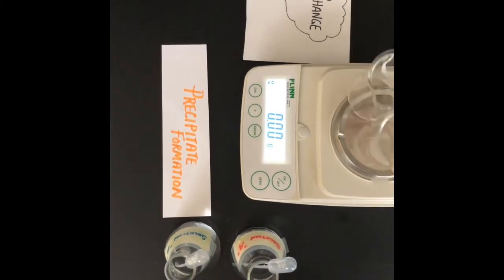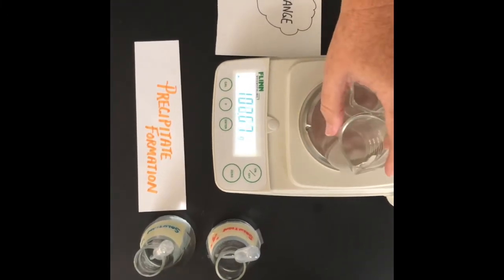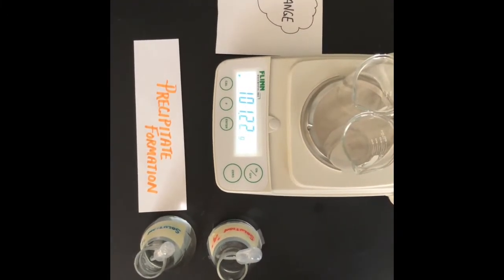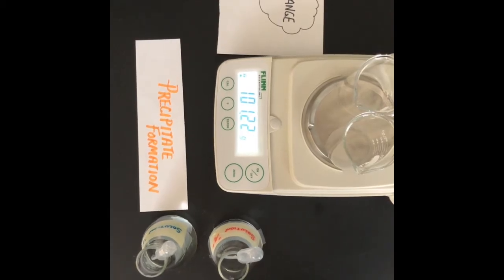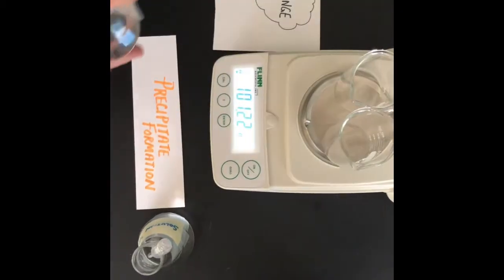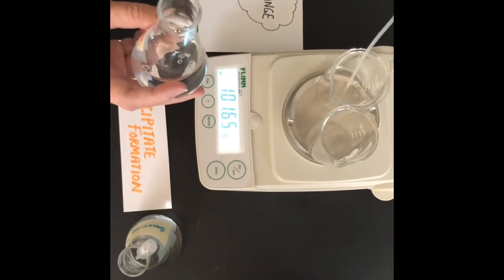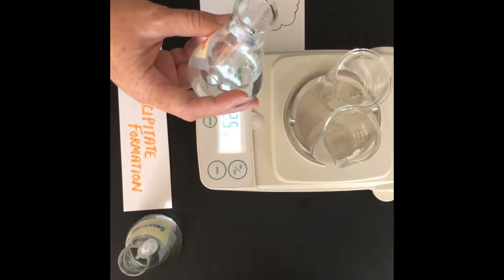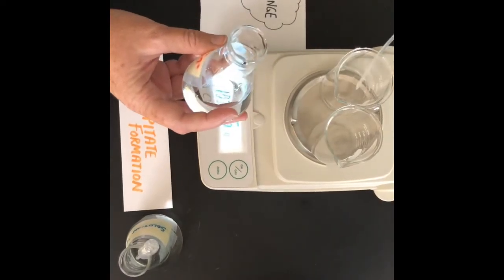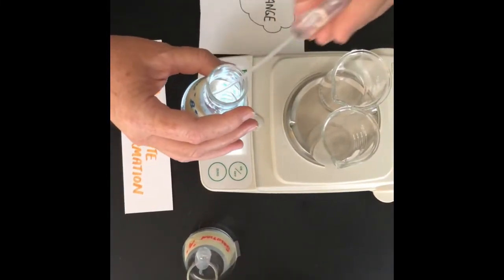I'm going to place both beakers on the balance, and you will notice that the collective mass is 101.22. I'm going to add 2 squirts of solution A in the beaker on the left and 2 squirts of solution B on the beaker on the right.